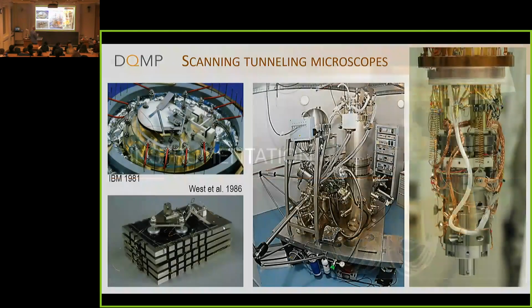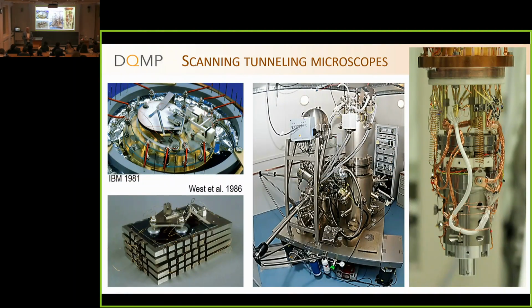Okay, instrumentation. Here, just to give you a feel for the evolution of these instruments, is again the first IBM instrument. Initially, when I started doing STM, you could not buy these instruments. So you would build them, and the main difficulty was always to isolate the vibrations. The stability of the tip is much better than the surface of this table, which is moving just because I'm talking. The fact that you hear me is because there is a wave and things are vibrating. Initially we would build some of these stacks to decouple, but everything was essentially pretty rugged. There was no sophisticated means.